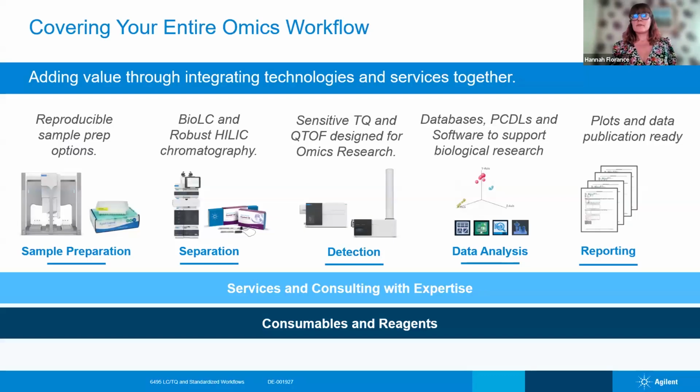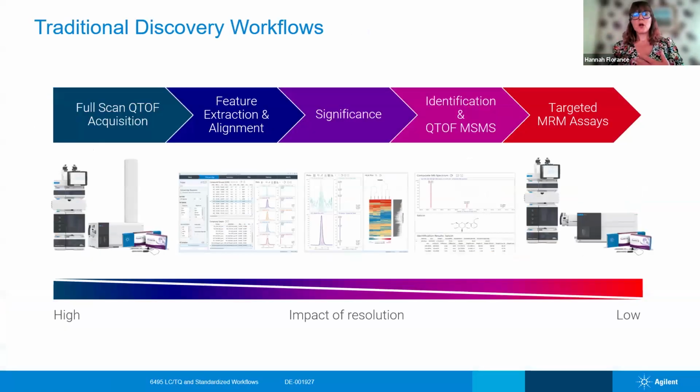Those of you that are familiar with us will know that we like to cover the entire omics workflow, right from the sample prep through the LCMS side of things and data analysis, and also the reporting. So just to put some context into my talk, before talking about the triple quad, why it's so good to use these standardized methods for these metabolomics and lipidomics studies.